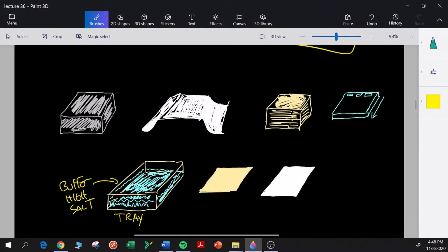So we have a tray here filled with the high salt buffer. And one of the nice things about the salt, it helps maintain the charges on the nylon membrane and the charge differences there. But also it helps inhibit enzymes that might degrade the RNA. And the buffer is going to help transfer the RNA from the gel to the nylon membrane. So we have this tray with a buffer.